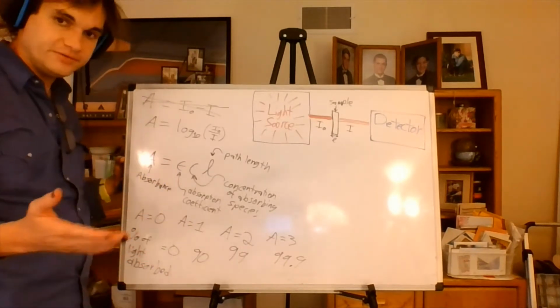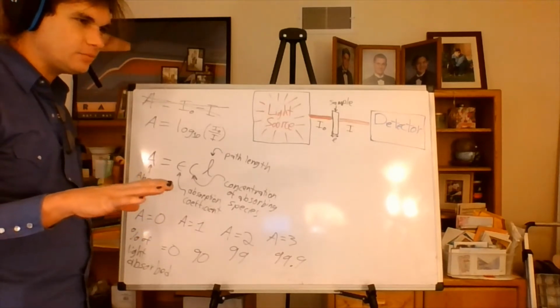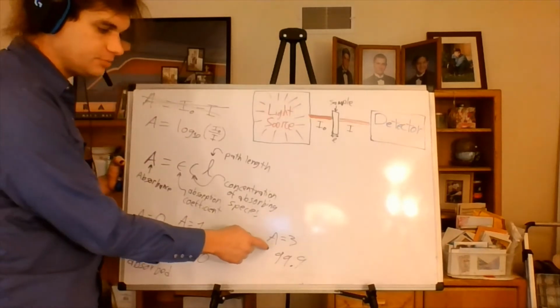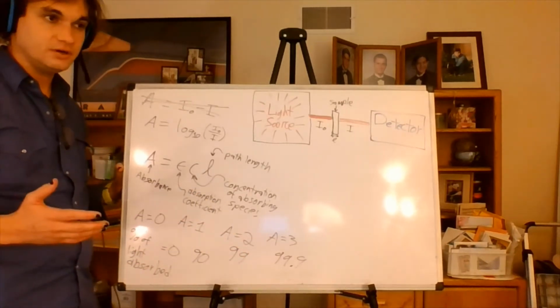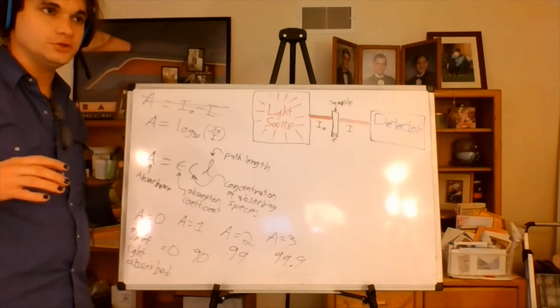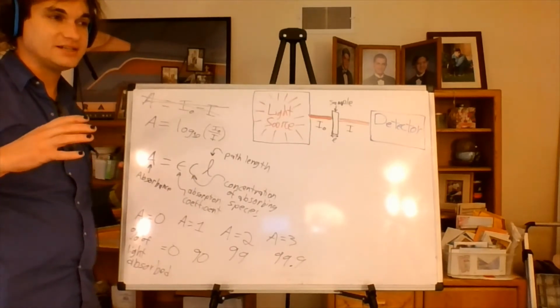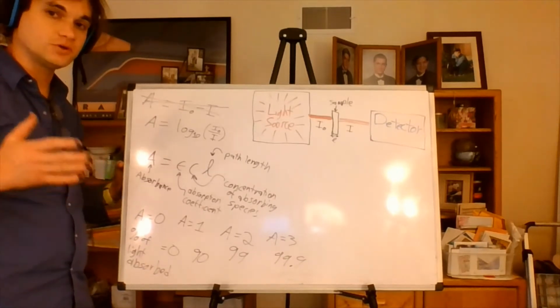Now, for the device that we have in the lab, I am not very confident about trusting it very far beyond an absorbance of 3. There are some commercially available spectrophotometers with detectors that can measure absorbance up to 6 or sometimes 8. I saw one that's advertised as going up to 10 absorbance units for certain wavelengths.